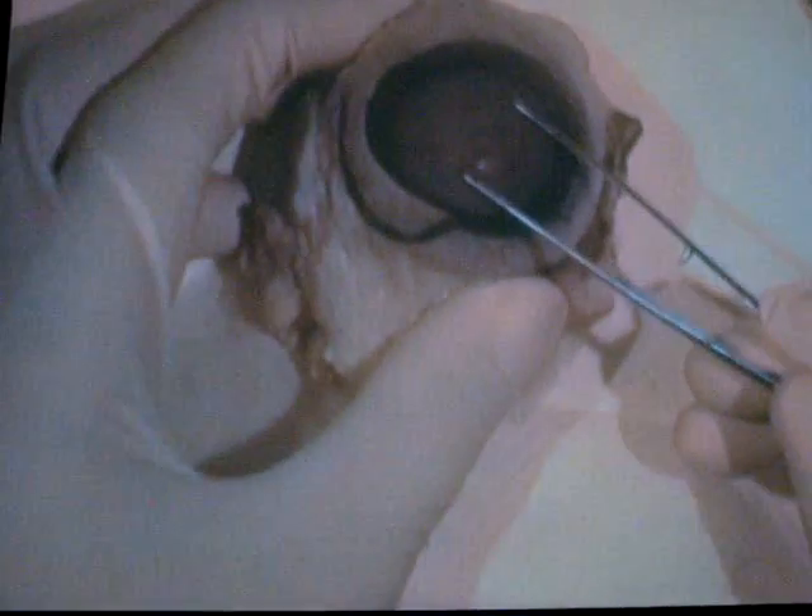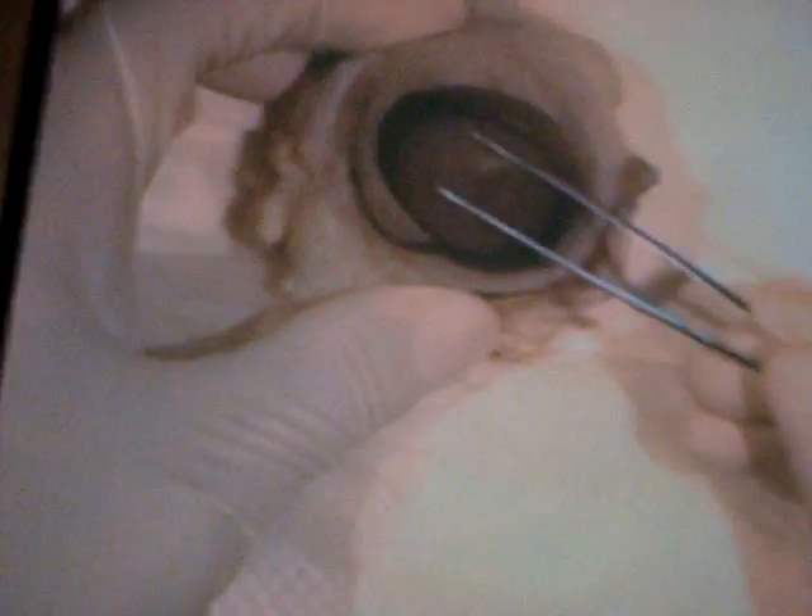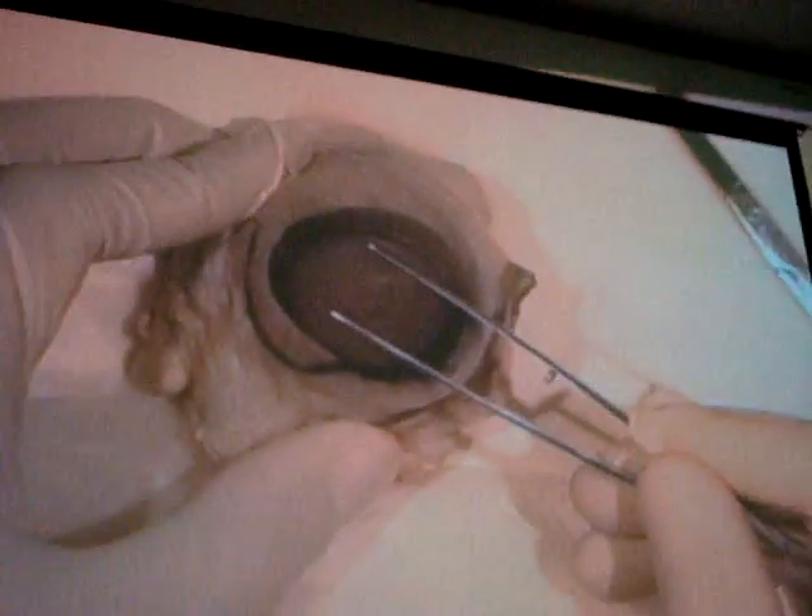I'm talking about what we see. On the outside, this is the clear part of the eye called the cornea. When a person puts a contact lens on, it sits here on the cornea. When a person has LASIK surgery, that's also done here on the cornea.